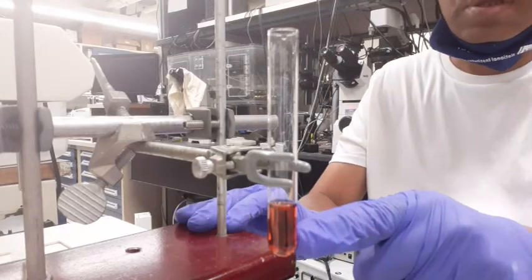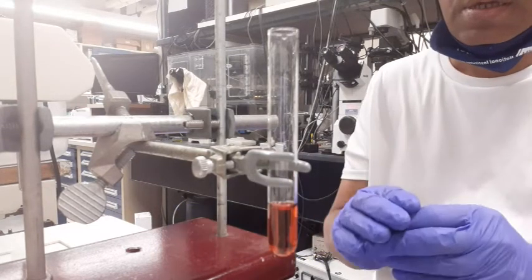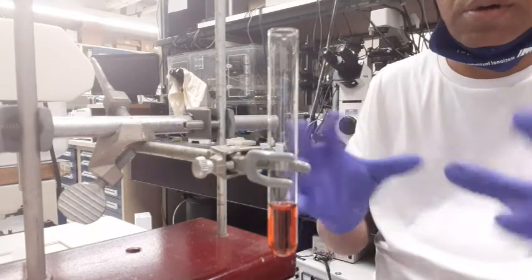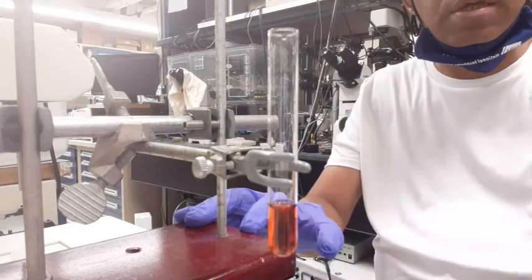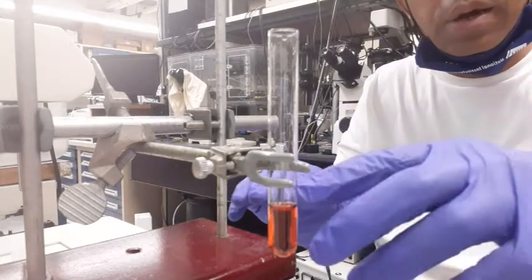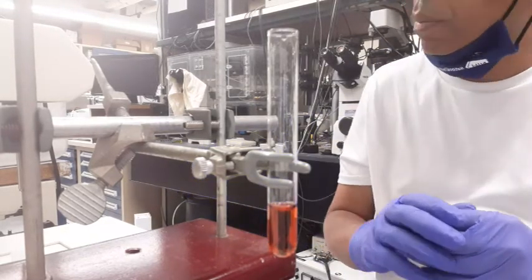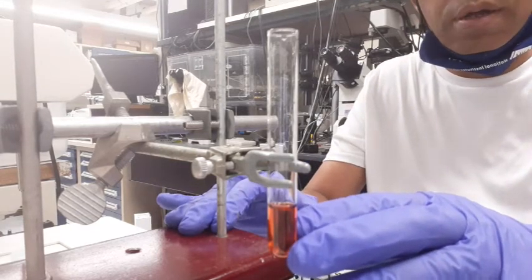What you see here is a cobalt-2-hexahydrate solution — it's completely all water around cobalt. In order to demonstrate Le Chatelier's Principle, we'll be adding chloride ions so that the reaction shifts toward forming the cobalt-2-tetrachloride complex.